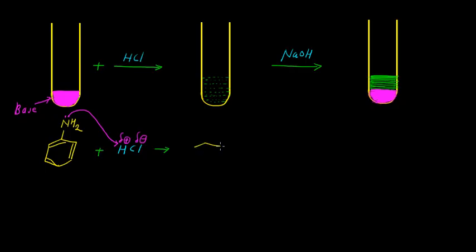So let me draw the structure. Now here you can see that we have nitrogen plus, now here I will write H3. It indicates that this nitrogen absorbs this proton, and we have the delta positive charge on this nitrogen, and this delta positive charge is stabilized by this chlorine minus.